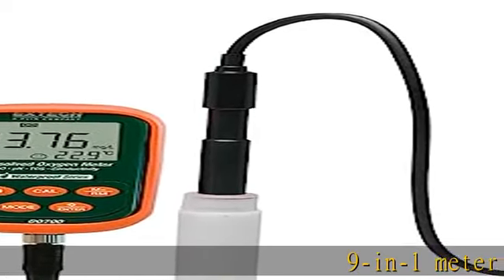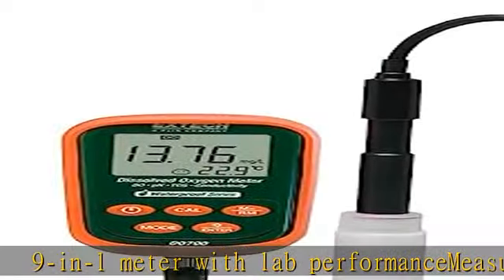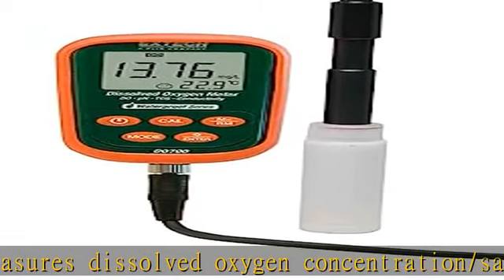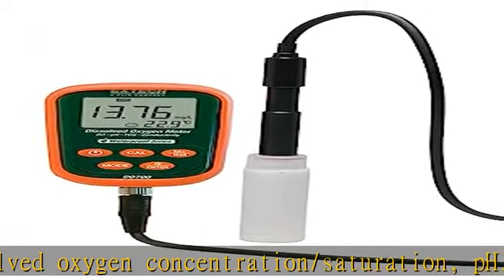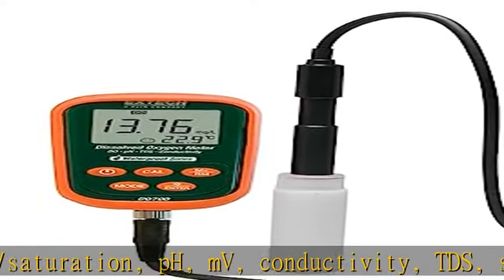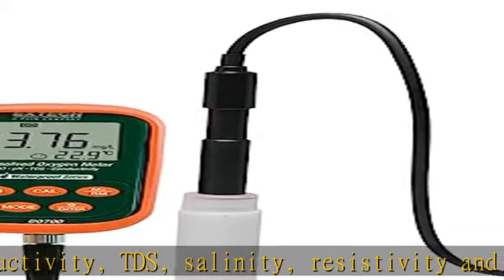9-in-1 meter with lab performance measures dissolved oxygen concentration/saturation, pH, MV, conductivity, TDS, salinity, resistivity, and temperature. Automatic salinity compensation and manual barometric pressure compensation for dissolved oxygen measurement. Zone button pH calibration at 4, 7, and 10 pH.